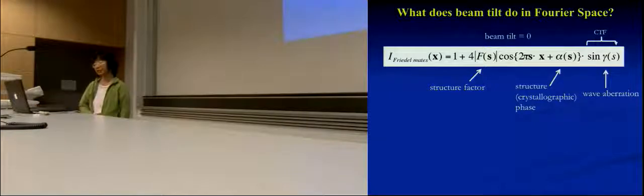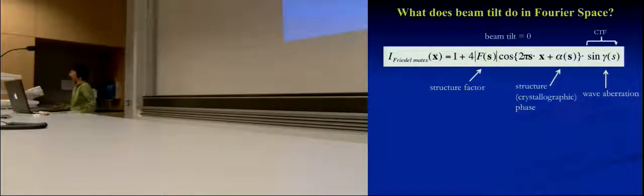Okay. This probably is the talk with the most equations. You go back to the first day when Henning talked about the Fourier transform. So this is a lot of things that are coming out from there, but in a little different form, just so that I can give you an example. Now, if you are doing X-ray crystallography, in which you are not forming an image, in Fourier space you will talk about having a structure factor that has an amplitude and also has a phase coming from your structure. So that's what this part is.